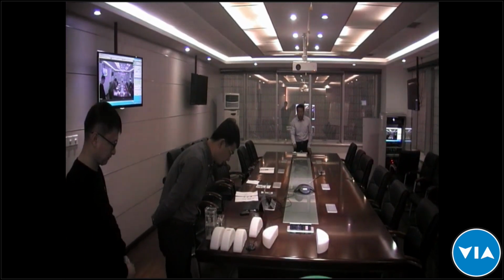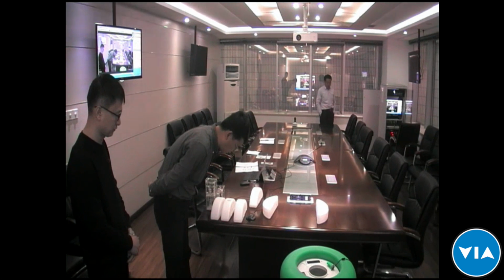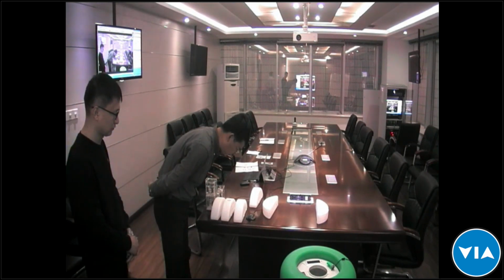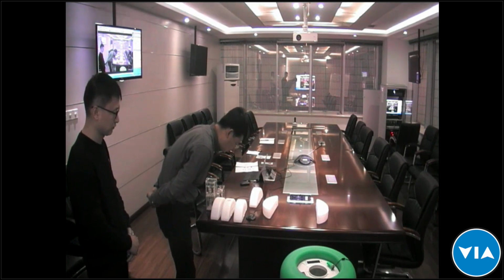Okay, perfect. And we also have some feedback from Michael over at Global Good for some of the questions that have come in. For the question related to how many vials will fit per vaccine stack, that does depend upon the size of the vials. It's going to be approximately 220 to 240 for the 1 mil or the 0.1 mil vials. And for the temperature question, the feedback is that it can be adjusted from negative 60 to negative 40, negative 20 to 4C, as well as other temperatures. But it's important to use water to be qualified or certified with PQS.